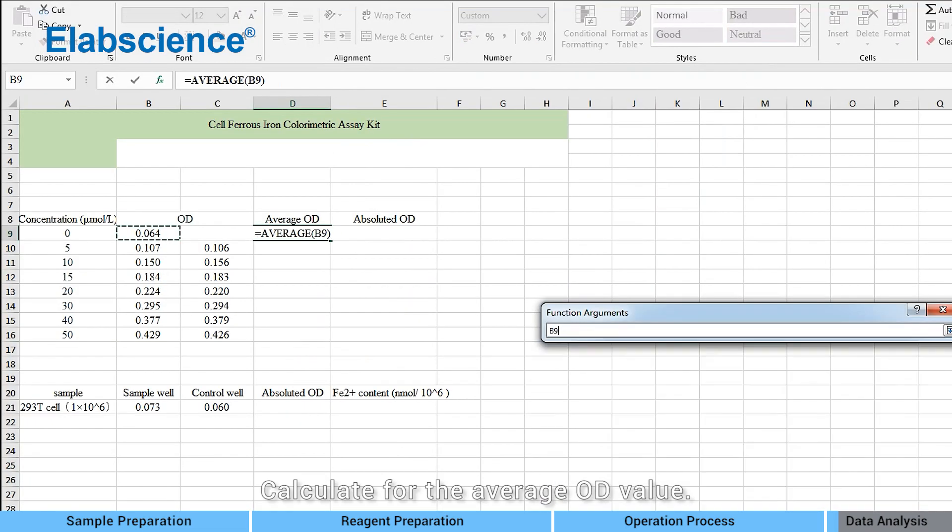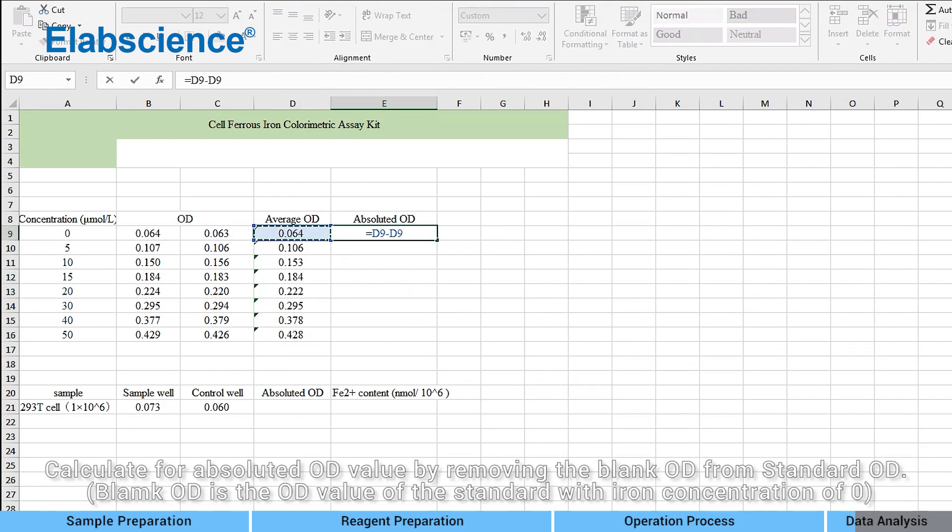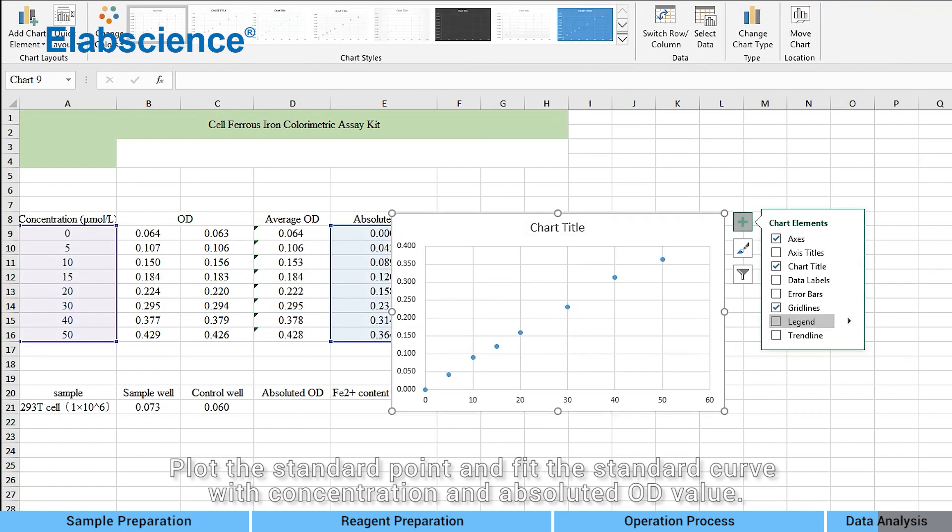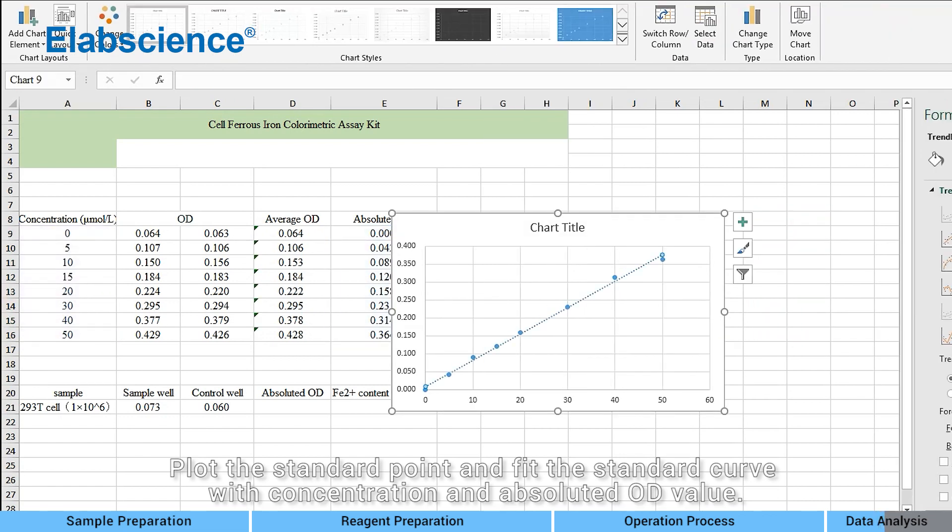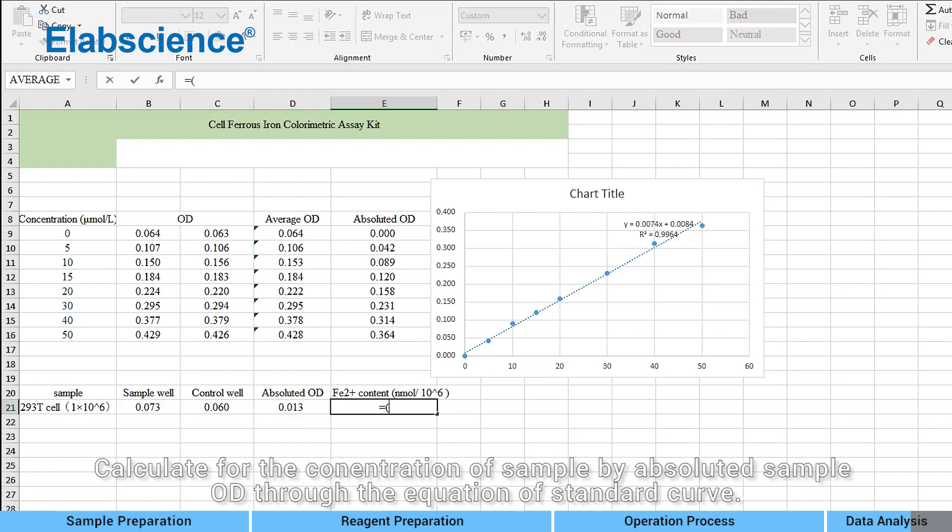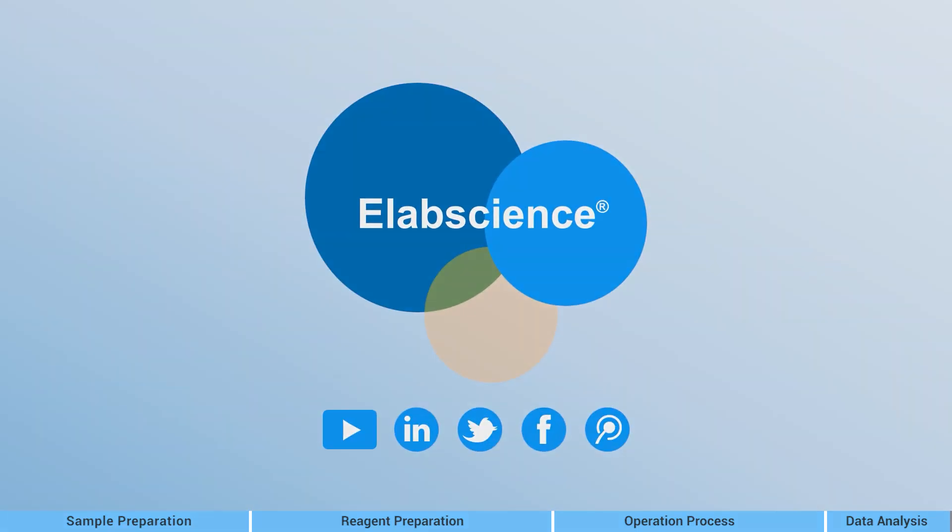Calculate for the average OD value. Calculate for absolute OD value by removing the blank OD from standard OD. Plot the standard point and fit the standard curve with concentration and the absolute OD value. Calculate for absolute OD value of sample by removing control OD from sample OD. Calculate for the concentration of sample by absolute sample OD through the equation of standard curve.